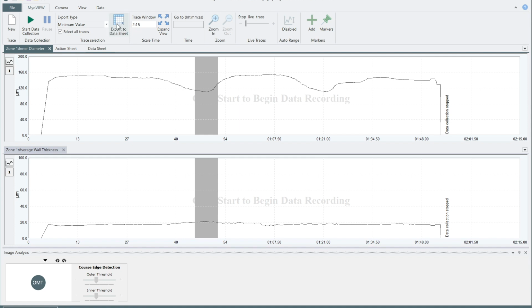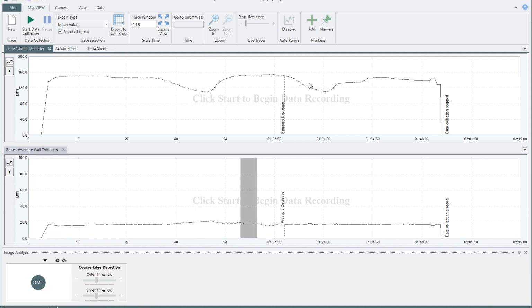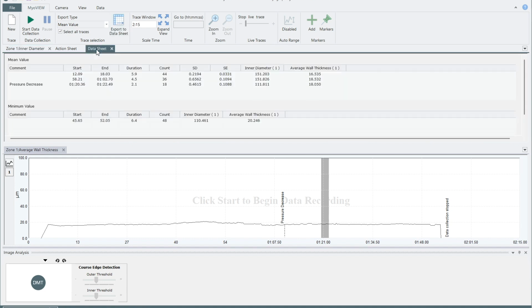The first time you do this, the datasheet will pop up. All subsequent measurements will be taken in the background. You can see information about your time selection and also the calculated values from your active parameters. We'll highlight another couple of selections to take additional readings and add them to the datasheet.